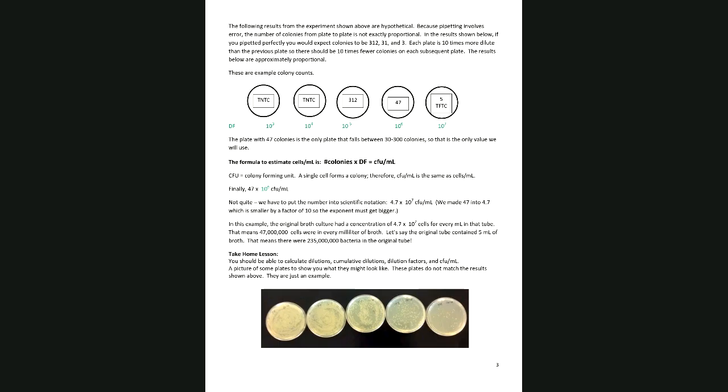So there are some problems with clustered bacteria. They don't work well for estimating in the spectrophotometer. And again, live and dead cells absorb equally. So those are some limitations of using a spectrophotometer. Our technique here just measures live cells. So questions?